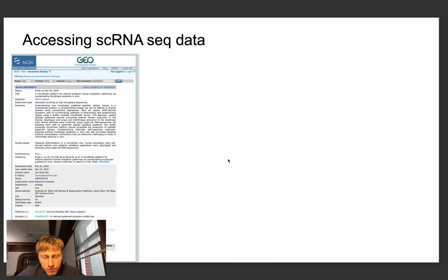You can convert those three files to an H5AD and then use them for further analysis.